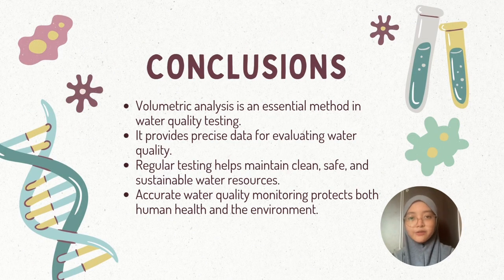In conclusion, volumetric analysis is an essential method for evaluating water quality. It provides precise and reliable data on important water parameters, helping us determine whether water is safe for use. Regular water quality testing not only protects human health but also preserves the environment and ensures sustainable water resources for future generations.